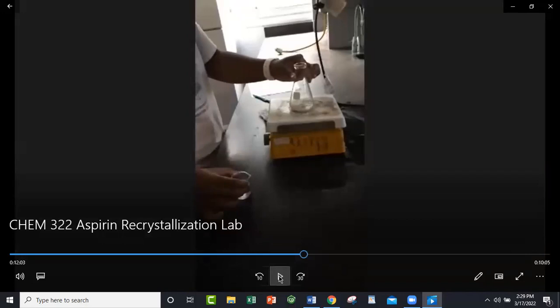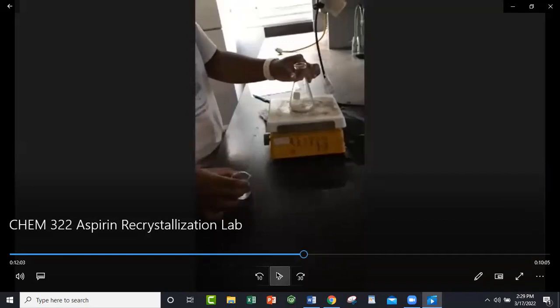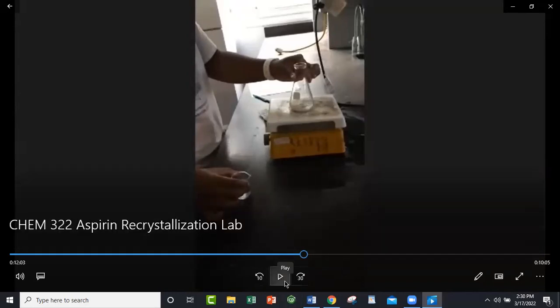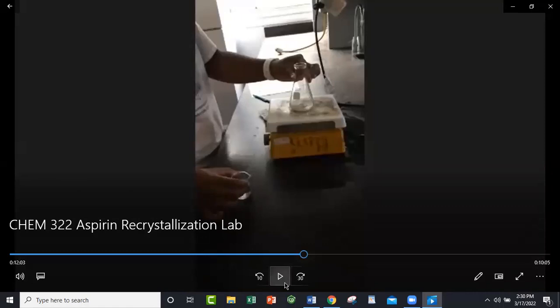The key here now is to keep heating and swirling until you get all of that solid in solution. If it's not all in solution, you either have to continue to heat it, or you can take a glass rod and break it up if it's in chunks. Again, it's a physical change, it does not change the chemistry of aspirin whatsoever. You can beat on it, pulverize it, crush it, whatever you need to do. It doesn't matter. Sometimes you might have to break up the chunks of aspirin, and they're really packed together. So you keep heating until everything goes into solution. Keep heating and keep swirling.